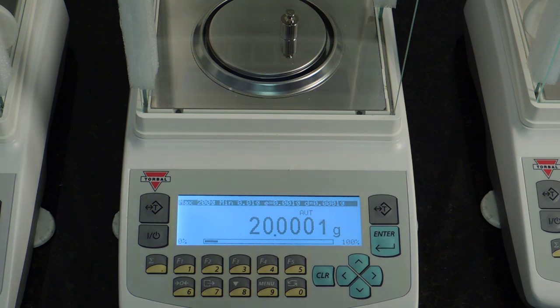As you can tell, very accurate, very precise and stable. So if you're looking for precision accuracy in your laboratory, this is definitely a scale you should look into.